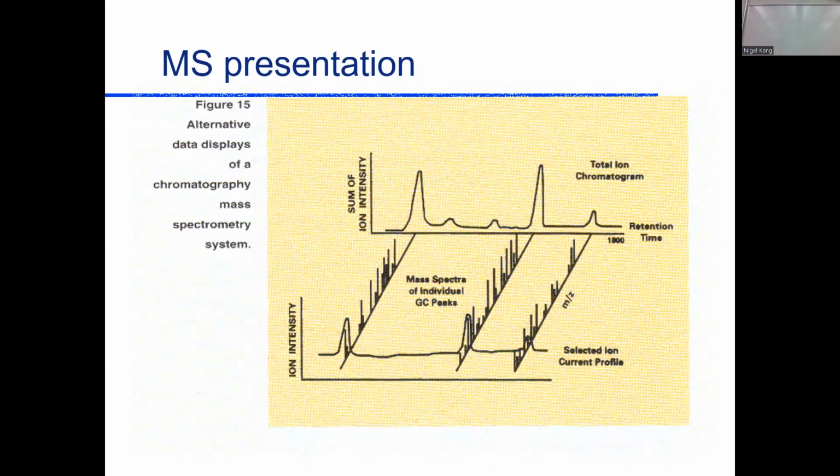Mass spectrometry, individual peaks. So there you'll have an LC. So your LC is feeding your mass spectrometer. But the LC has the ability to convert all of these ions, whatever ions that they form, into a peak. So you see peaks, but they're the sums of all the ions that a molecule was broken into. And so you get what I call a total ion chromatogram that's generated over time in your LC-MS. But the whole time, the mass spectrometer is bombarding, counting, sorting all the ions. And that gives you a trace across all of your compounds that you can use for identification.